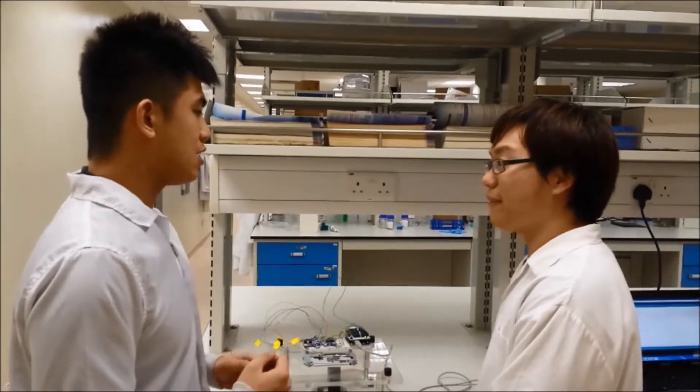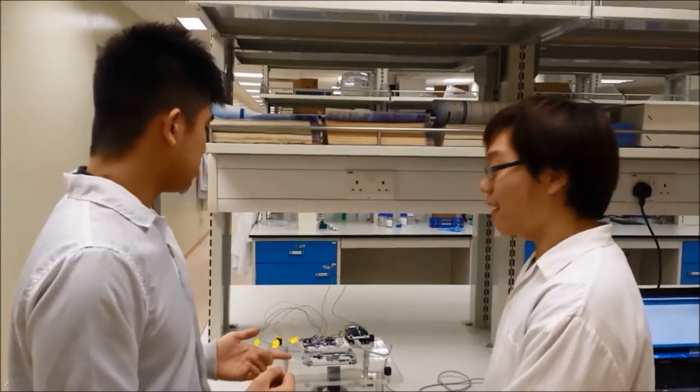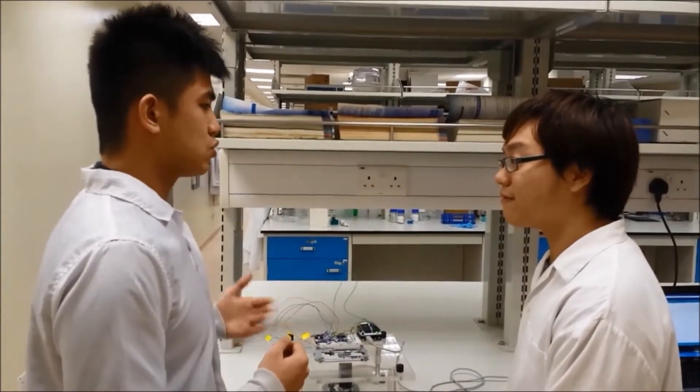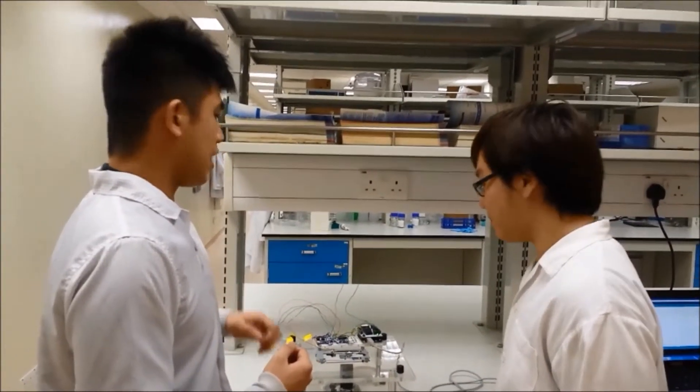So basically, our DIY bioprinter consists of four hardware components. They are the ink cartridge, the motors scavenged from four CD-ROM drives, the two stepper motor drivers that supply voltage to the motors, an ink shield, and the Arduino.